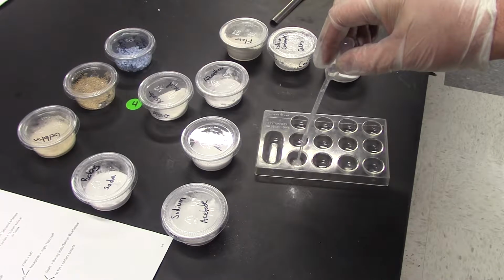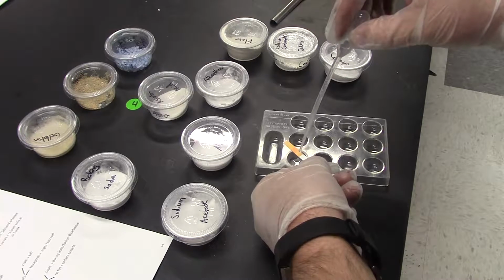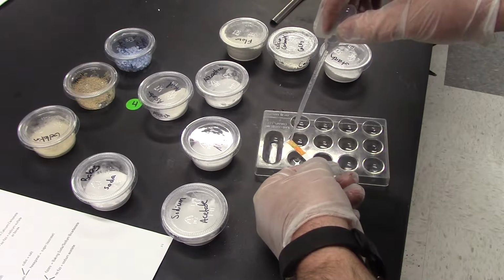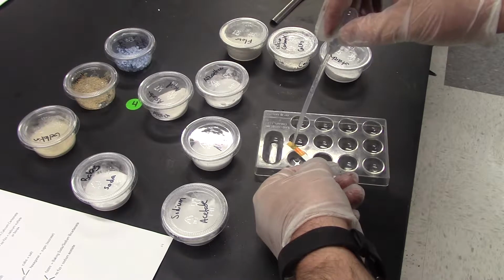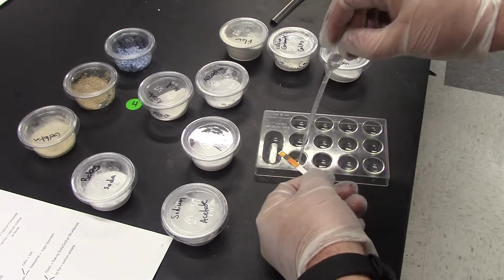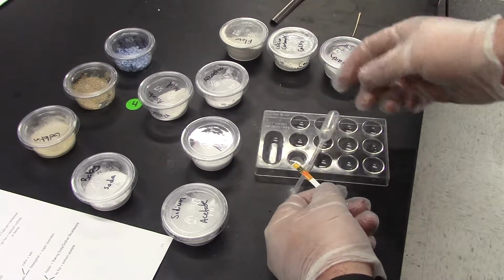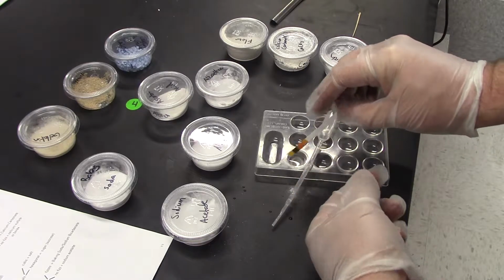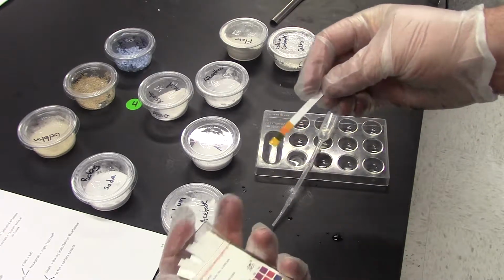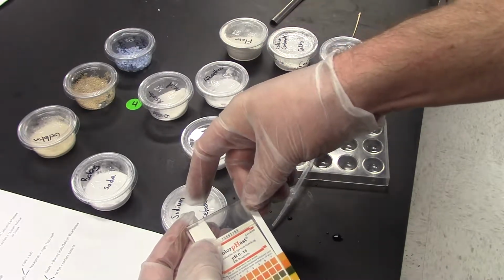I'm going to grab a small amount of the water that's right above this baking soda here, and I'm going to place it onto this strip. I'm just going to make sure that strip is saturated. You might notice it's changing color. Now at this point in time, this pipette won't do me any good for any other tests. Okay, so I'm going to take a look at the pH. I'm going to match the color as best I can.